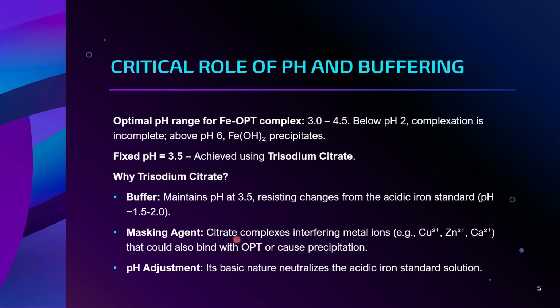It also masks other interfering ions such as copper, zinc, and calcium, because these ions could also bind with OPT, reduce its concentration and interfere with our analysis.